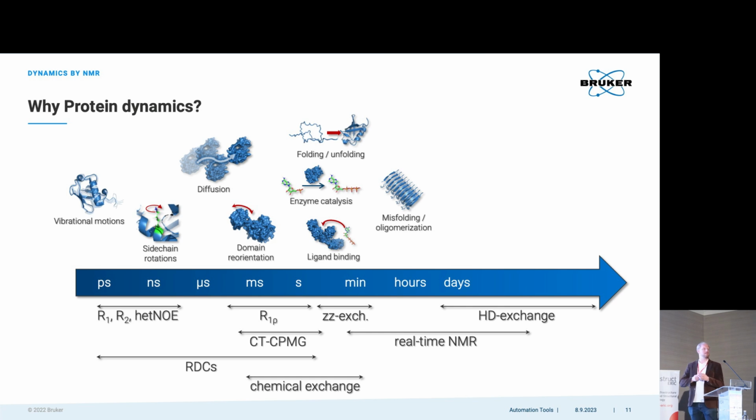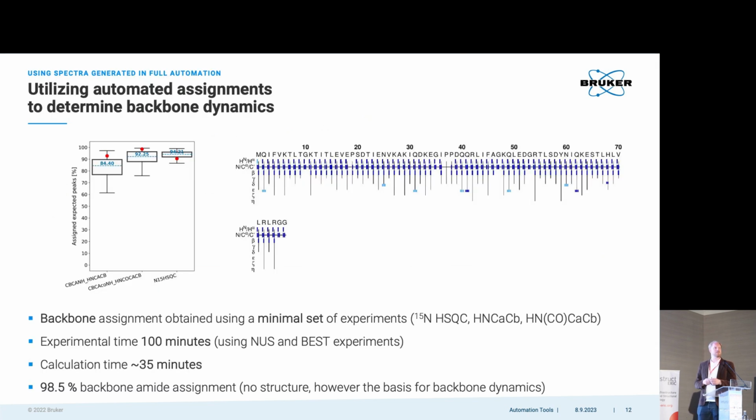Why should we look at dynamics by NMR? Well, there are plenty of reasons. Over the years, people have developed all these beautiful experiments that can cover an entire range of time spans. And it's not just because we can, but there are also actual processes happening on those timescales. But I think there's one quote from one of yesterday's lessons that probably summarizes this best: if it doesn't move, it's probably not that interesting. And forgive me for moving back to ubiquitin.